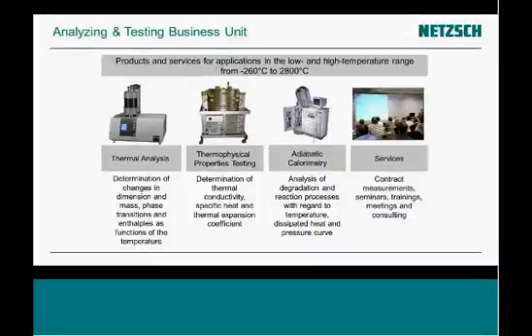Our focus area includes thermal analysis, which is used to determine the changes in dimensions, mass, phase transitions, and enthalpies as a function of temperature. Also, we have thermophysical property testing, which is used for the determination of thermal conductivity, thermal expansion coefficient, and specific heat.